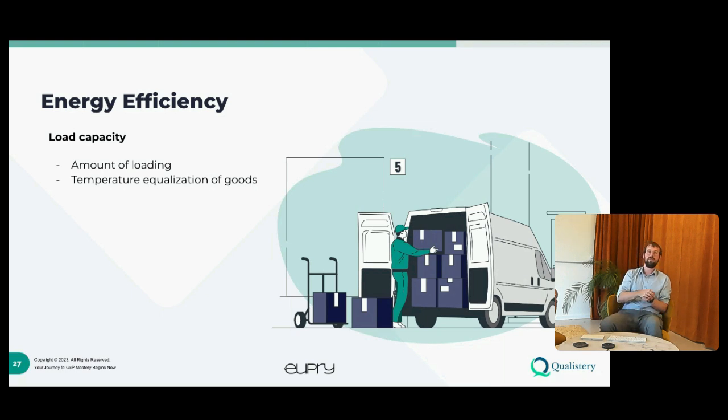Often these HVAC systems and compressors in fridges and freezers are designed for a specific amount of cooling capacity. And if by loading too much, or even in some cases too little, or using them in unintended ways, they simply go out into the area where they become very inefficient. That, again, can lead to temperature variation, simply because you do not use the time properly to freeze in products, or the temperature stability and homogeneity can be heavily affected.